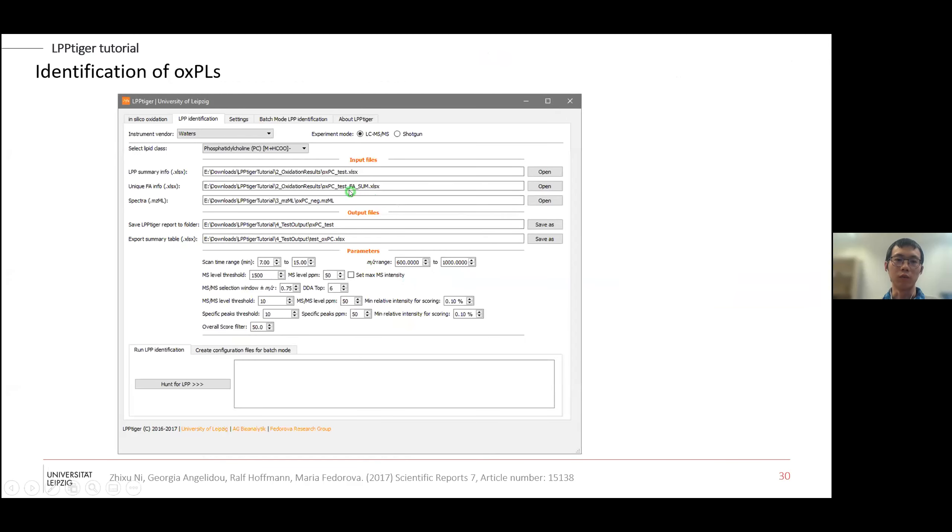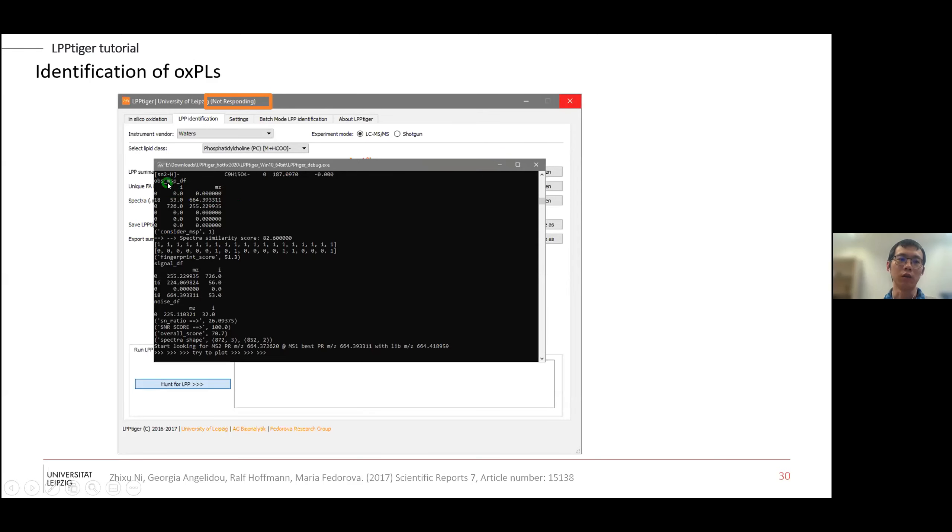Then you can start the software. You select this tutorial file from the vendor, you select LCMS and the phosphatidylcholines. You select these two Excels and the MZML file. Then you select where to save this output and the Excel summary table. There are some general parameters about the retention time range, m/z, PPMs and certain thresholds. Then you can click here just to start for the oxidized lipids. The software might not respond because the time of processing is very long. But if you are running the debug mode, you can see the software is trying to find something, already matching something, get some score or generating the images.